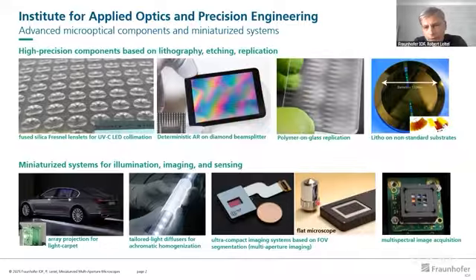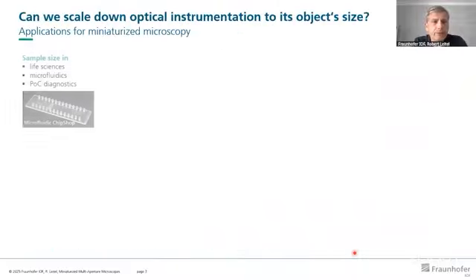Here amongst them, the flat microscope I will talk about, and then also multispectral imaging acquisition, where we have different filters inside a very compact system to get a broad spectral imaging and make such data cubes.